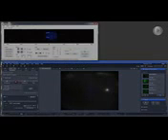Additionally, activation of the external communications package allows the VAST to automatically communicate with the external microscope and camera. In this setup, signals are sent back and forth between devices to coordinate the positioning and collection of each imaging job, with minimal or no user involvement after the system's initial setup. Once all imaging jobs are completed, the larva is sent to a bulk output collection container, unless a sort command is received instructing the VAST to send the larva to another location.